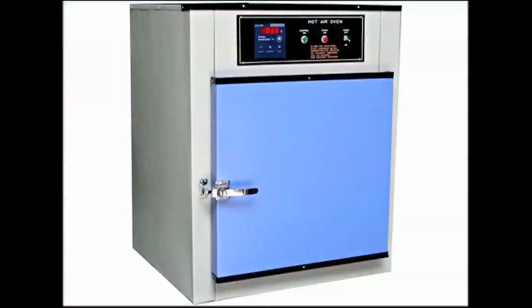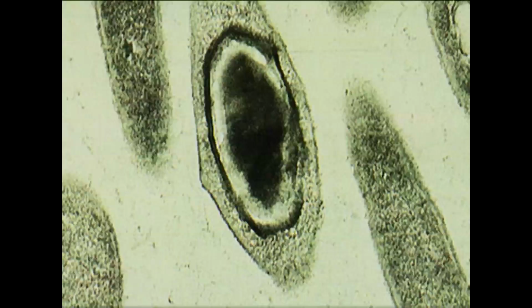Next, we will see the use of dry heat in the hot air oven. A hot air oven uses dry heat for sterilization, but the penetrating power of dry heat is very low. That is the reason we need a very high temperature and a longer exposure time to achieve complete sterilization or removal of viable cells as well as endospores.